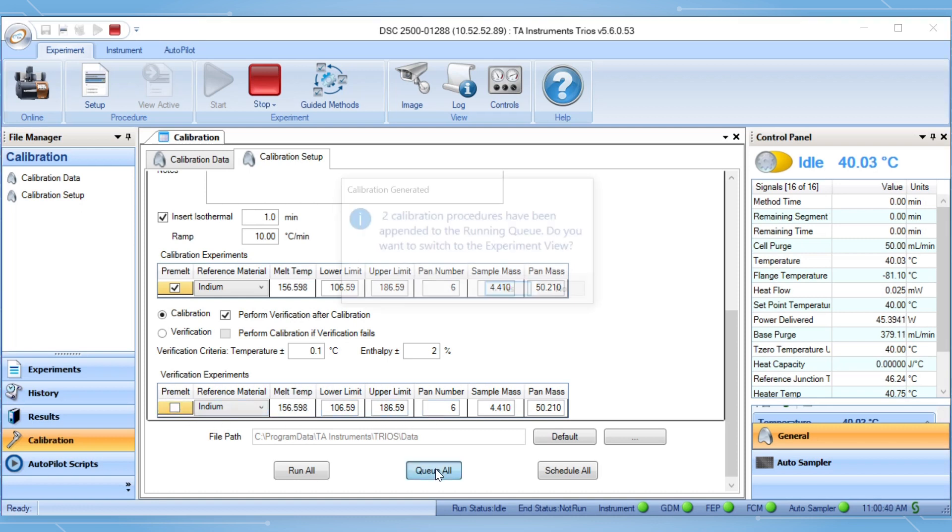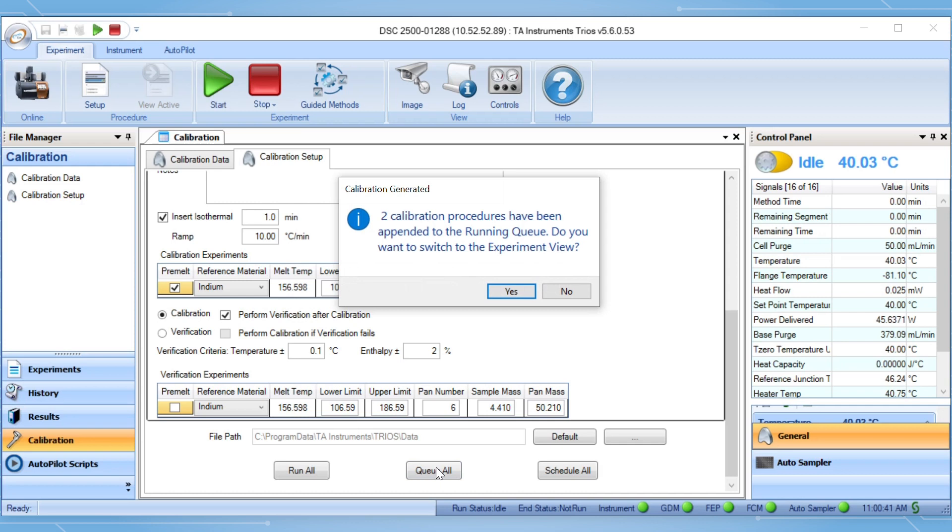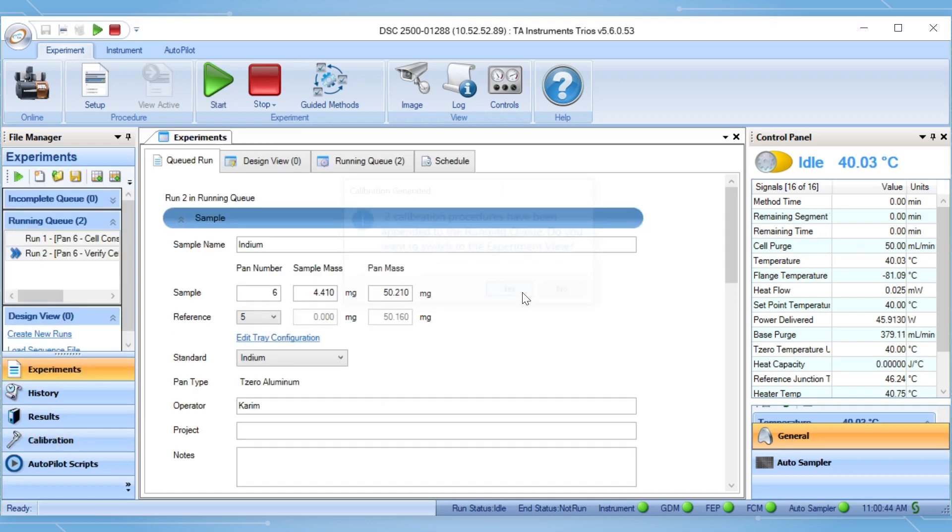Select queue all and then two experiments will be sent to the running queue. You can start the calibration run from the experiment tab after a final review.